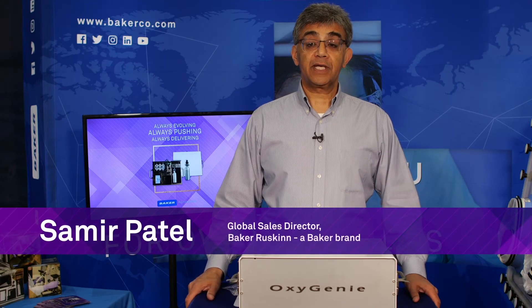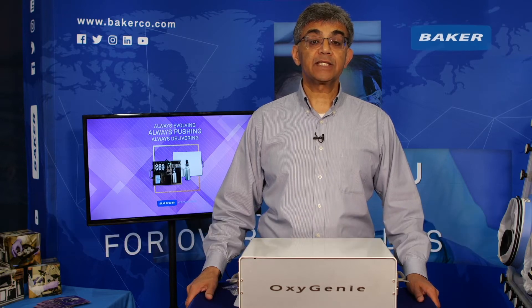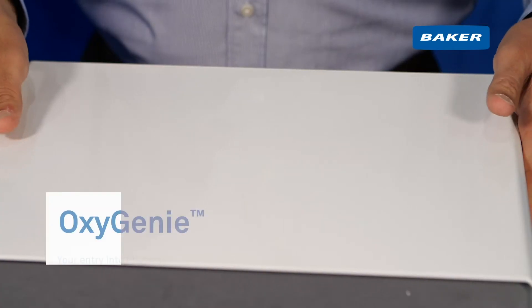Hello, my name is Samir Patel, Global Sales Director for Baker Ruskin. Baker Ruskin is a division of the Baker Company that's based in Sanford, Maine. I'm going to introduce a new, portable, plug-and-play cell culture system called Oxygeni.